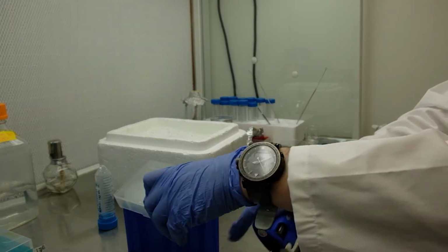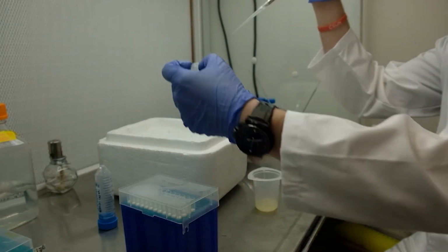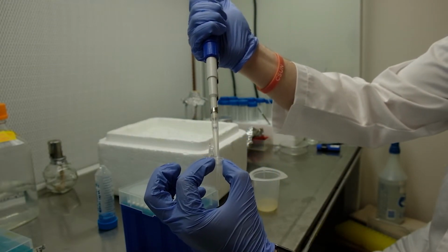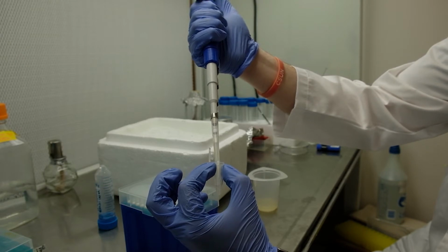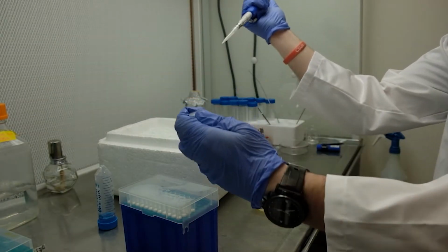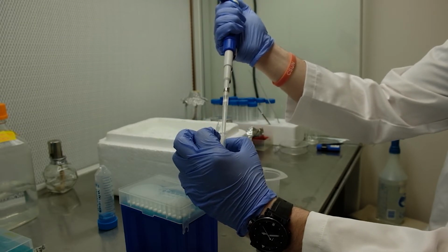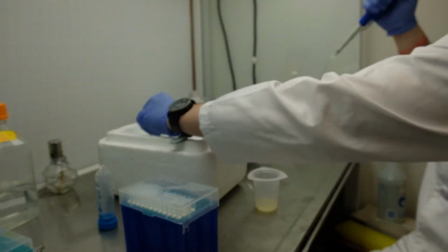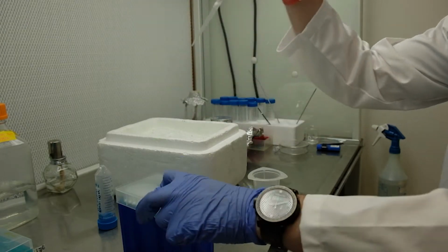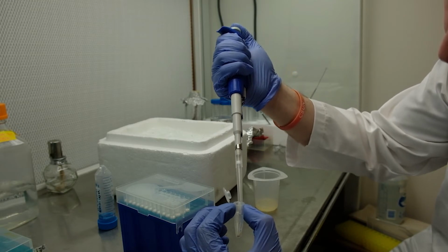Now, transfer the entire content of the microfuge tube into the corresponding cryo tube. And do the entire process again with the other sample, starting with resuspension.